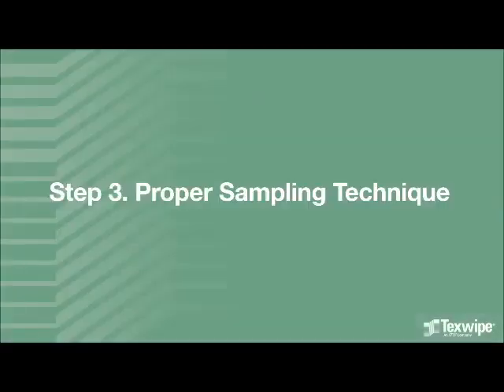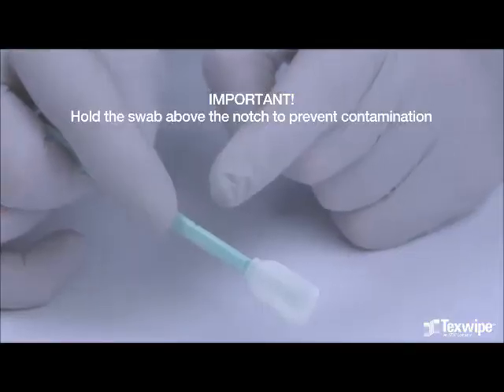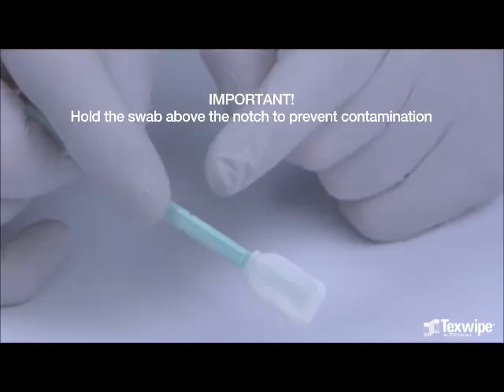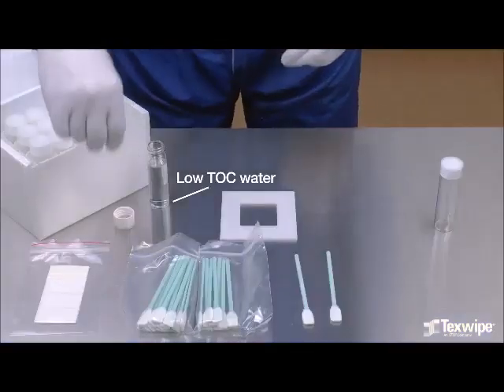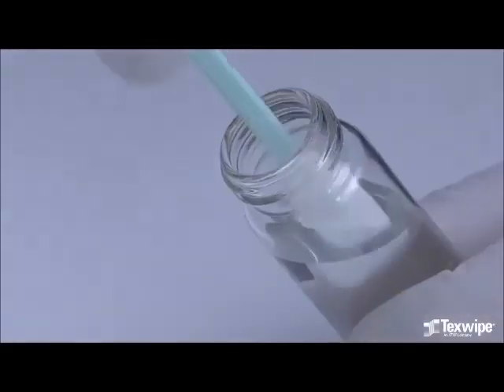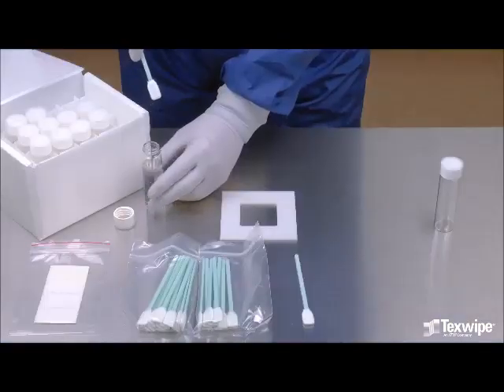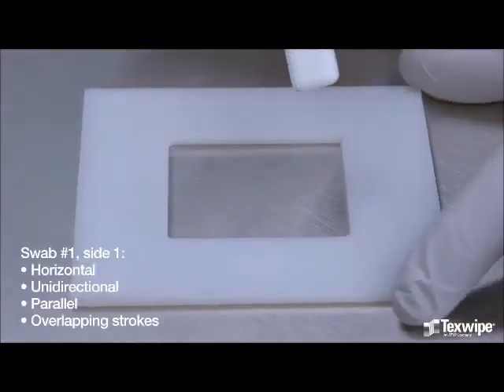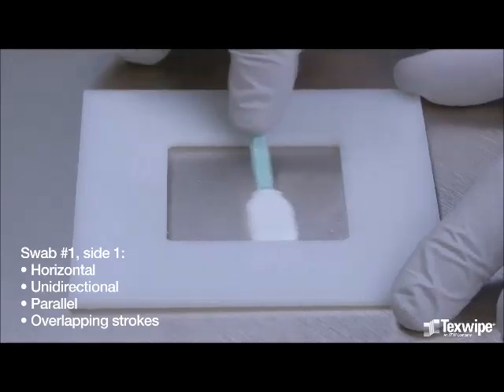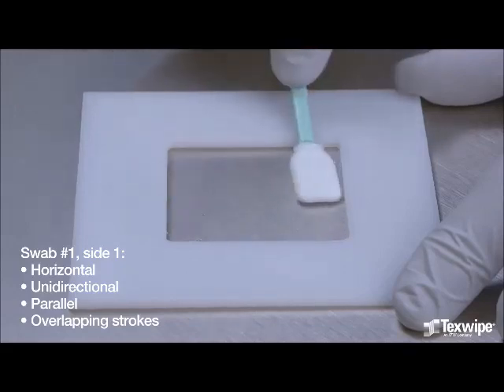Step 3: Proper Sampling Technique. Hold the swab above the notch to prevent contamination of the swab handle and head below the notch. Add low TOC water to the first vial. Dampen the first swab with water. Remove the excess water. Begin sampling by swabbing the surface using horizontal, unidirectional, parallel overlapping strokes. This is the first side of the first swab.